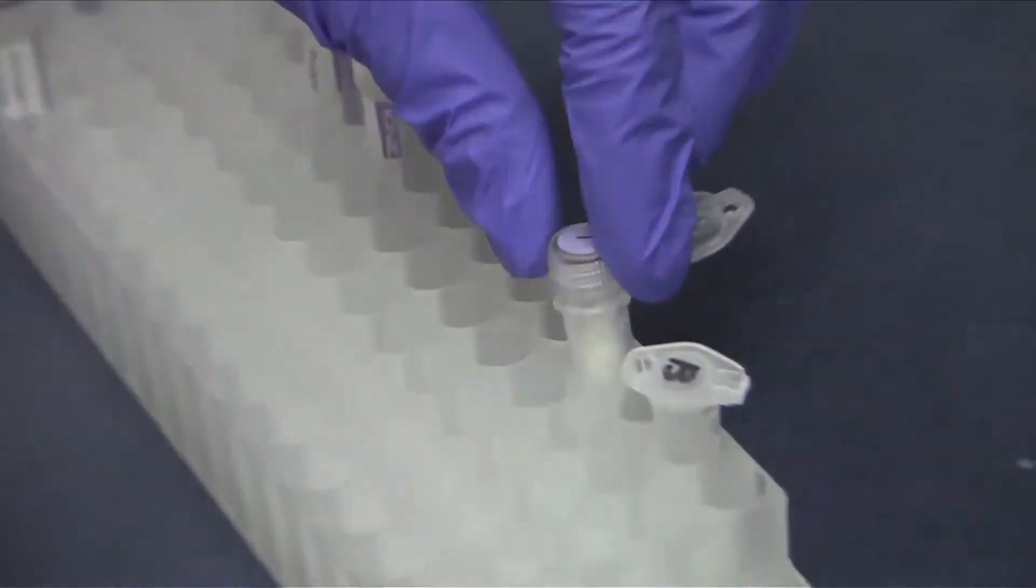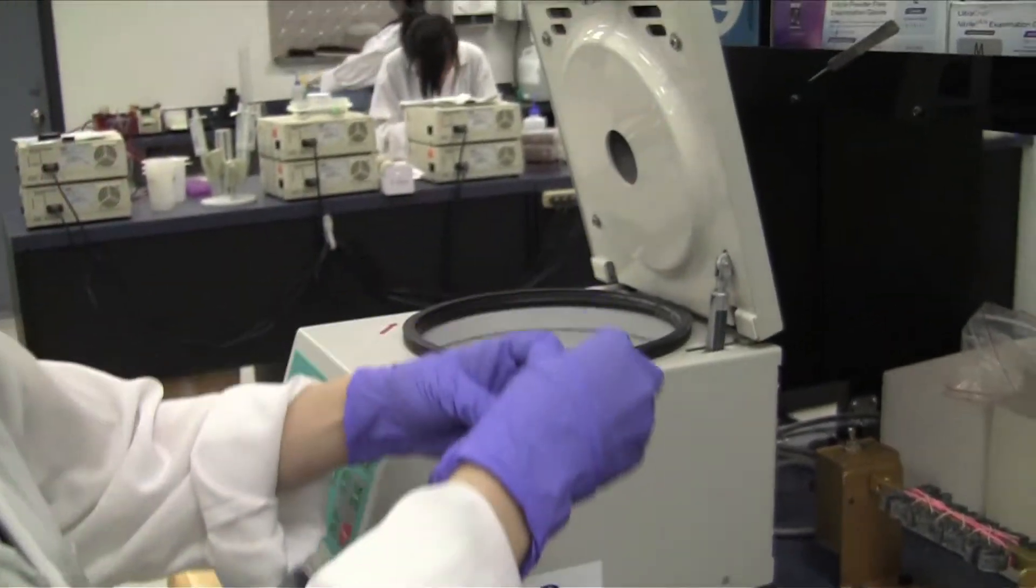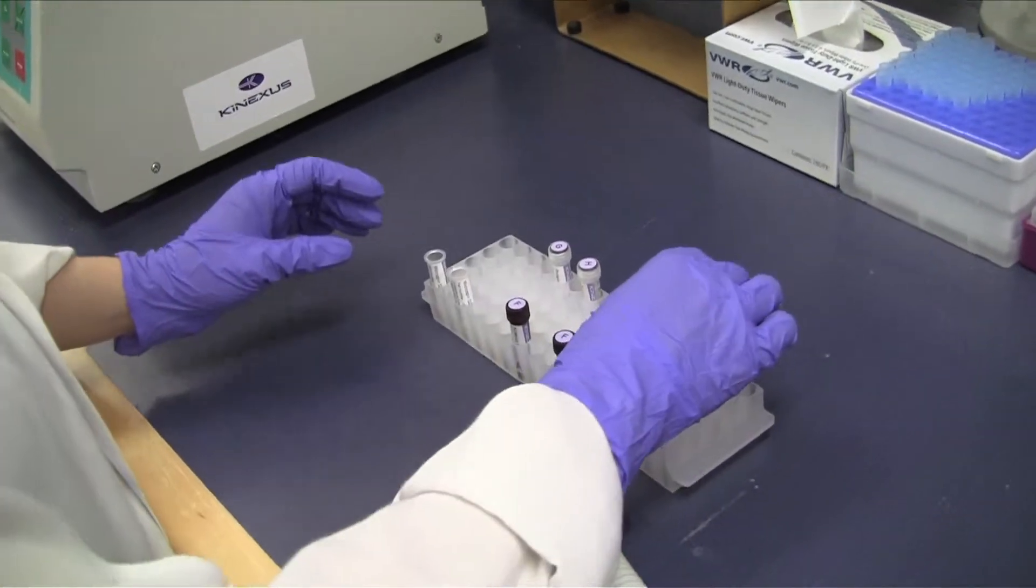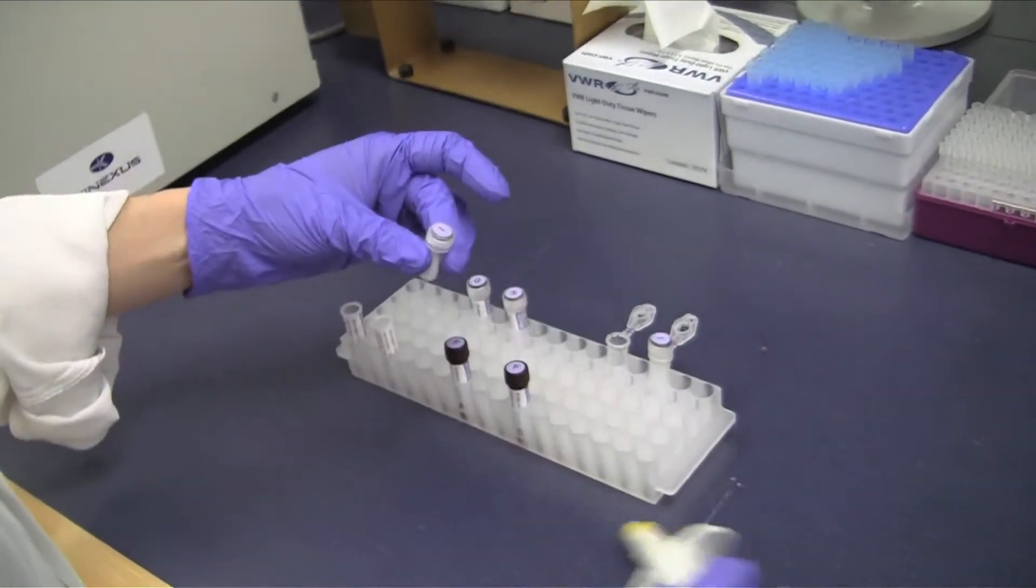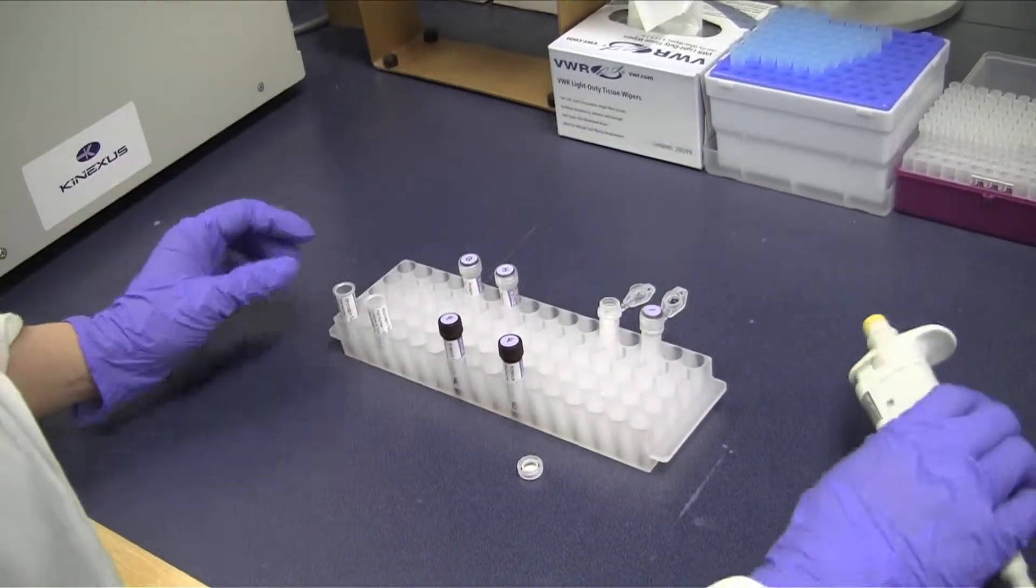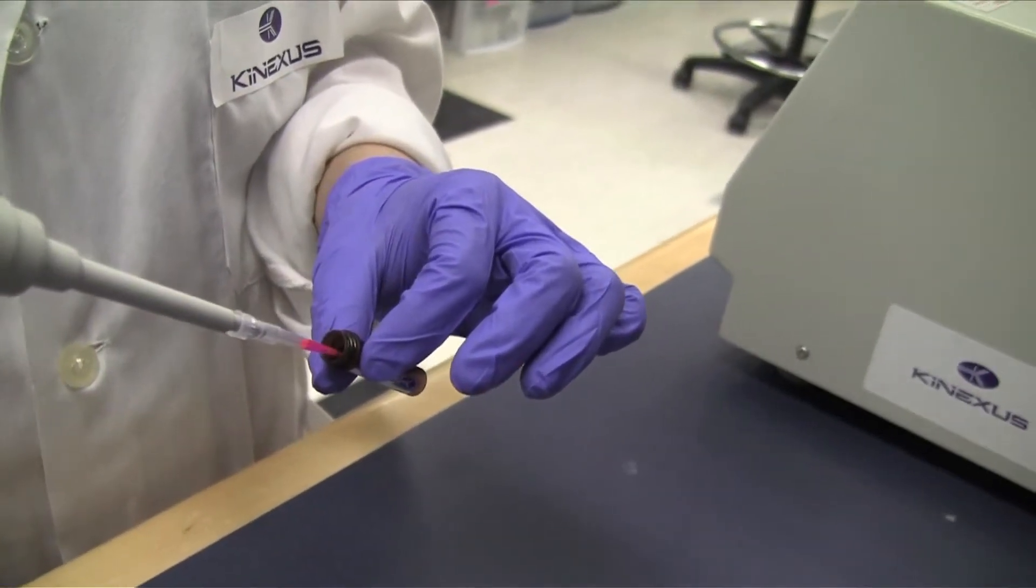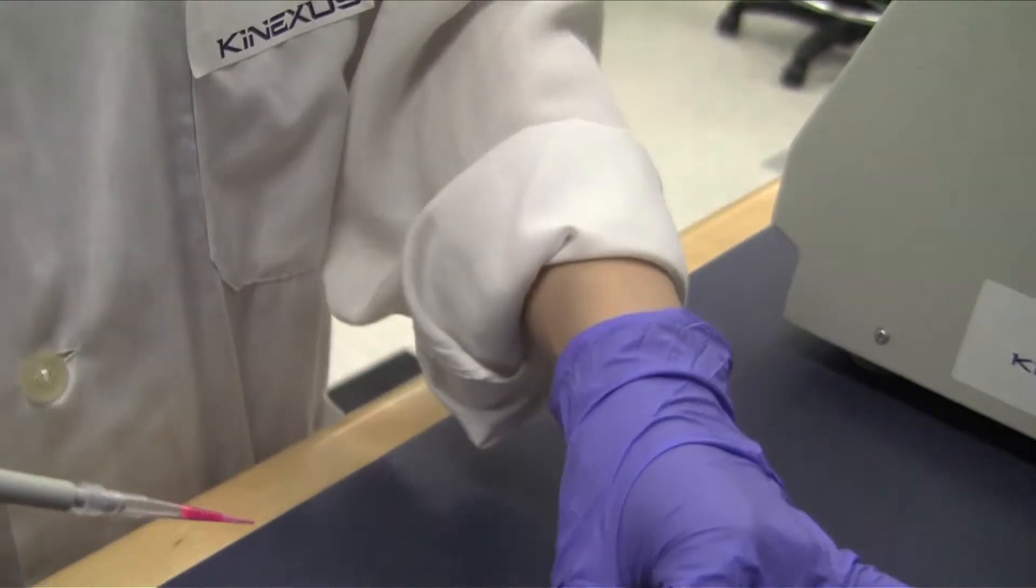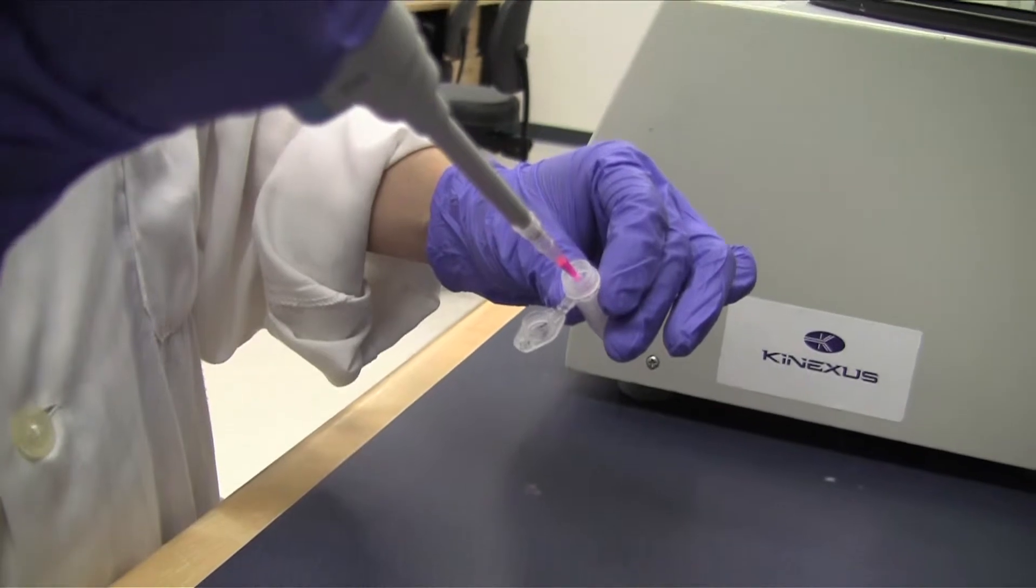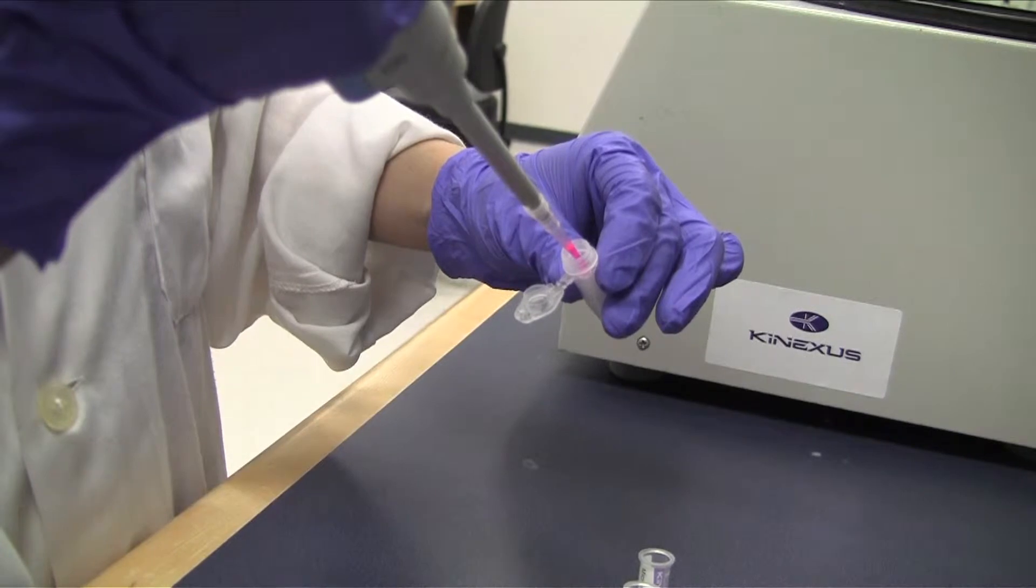Place the micro spin G25 column into a clean 1.5 milliliter microcentrifuge tube labeled with your sample IDs. Load your samples with the whole labeling reaction mixture slowly onto the top of the resin of the column. Your samples will appear pink in color due to the addition of the dye.